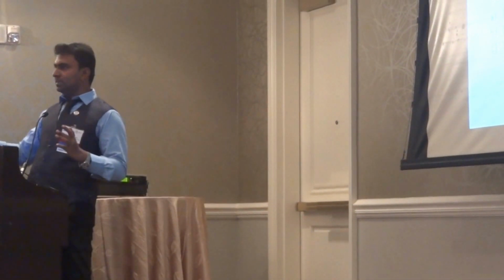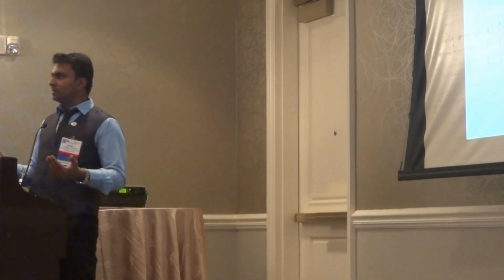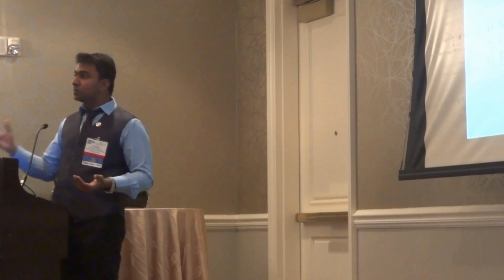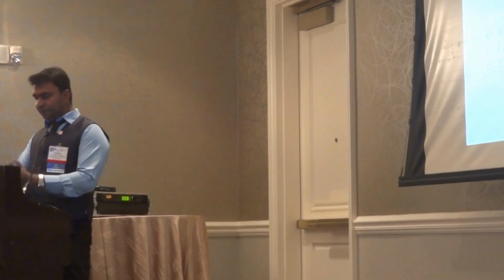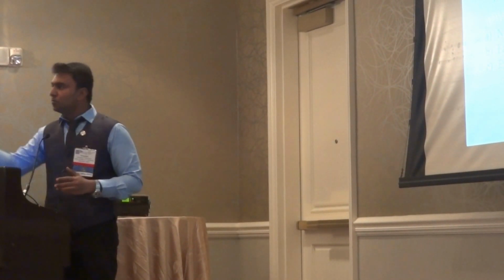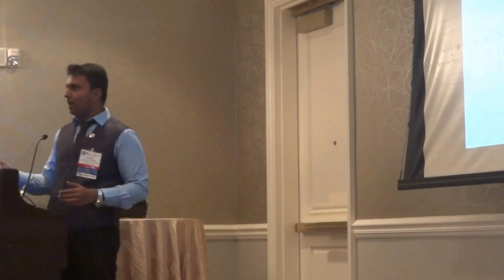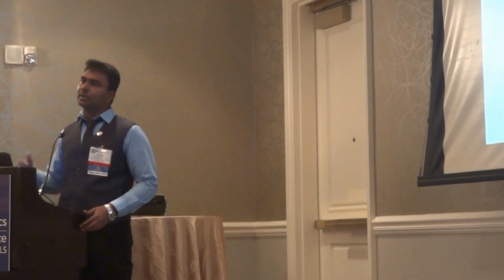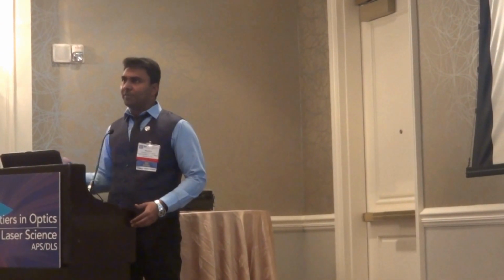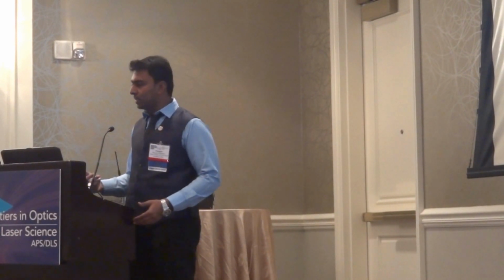Inline holography is where you have the object and the CCD all in a straight line. The main advantage of going to inline holography is that you are able to use the entire bandwidth of the CCD. And if you apply digital holography to microscopy, that you call digital holographic microscopy, and there are many advantages. The main thing is it's low cost, and optical aberration: since the strength of holography is in the computational part, you can remove everything by using the numerical reconstruction method.